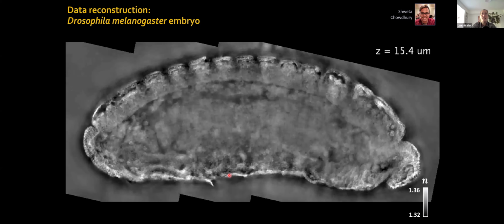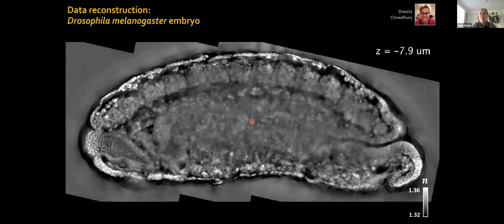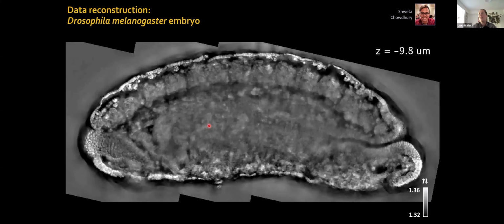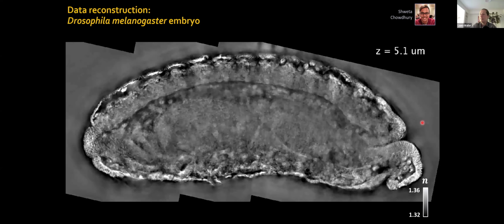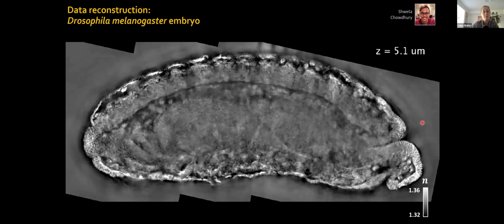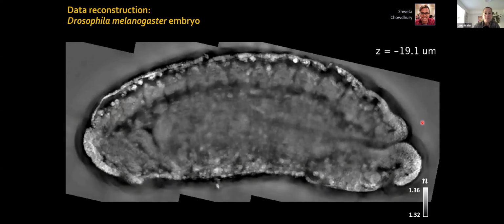And you can see in the center of this thing there's a lot of hazy garbage because it just can't solve for that much multiple scattering in this particular case. Chateau started his own lab at UT Austin since then, and he has taken some beautiful results. He basically just used a slightly longer wavelength to fix the problem, but also a few other really nice innovations. They're taking beautiful pictures, and I'll just leave that to him.